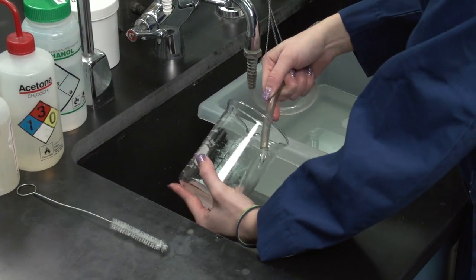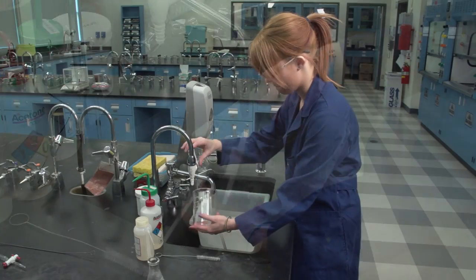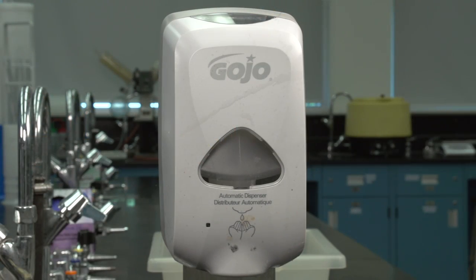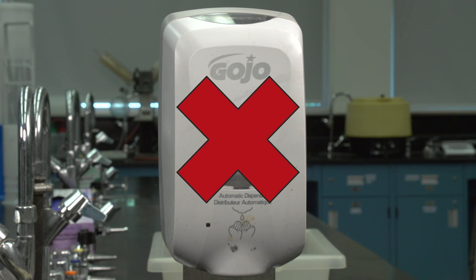After soaking, rinse the glassware thoroughly with tap water followed by a small distilled water rinse. Never use hand cleaner or soap. Hand cleaners usually contain hand lotion additives which leave an oily film on the glass.